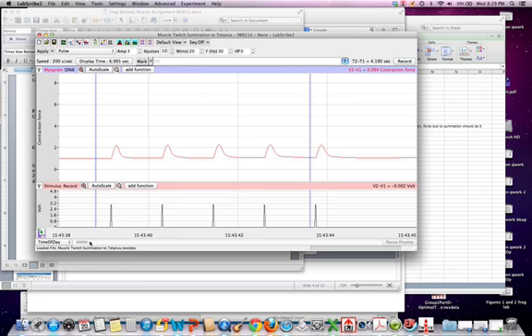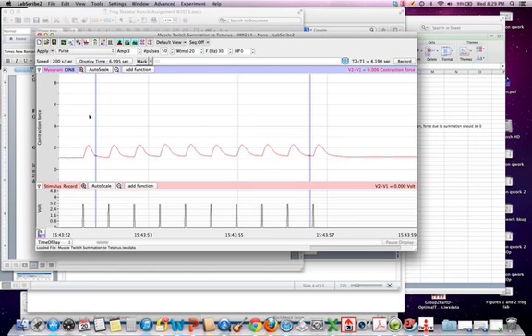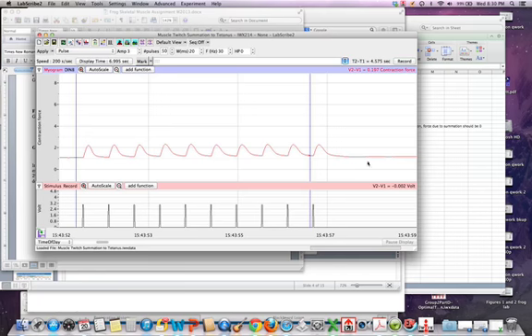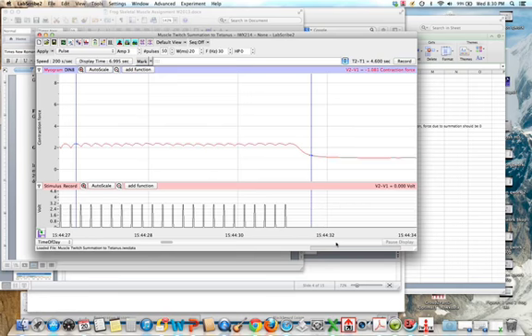Then we'll just scoot over to the next one, and our next stimulus here. You can see that the twitches are starting to get a little bit closer together. The summation is being depicted by where this line is here, in terms of trying to depict that we're seeing some kind of summation occurring between the different twitches, not at the peak of the twitches, but in between the twitches. So to help illustrate that, in this case it would be 0.103, and you can continue on, but let's go forward up to something like what we see here.